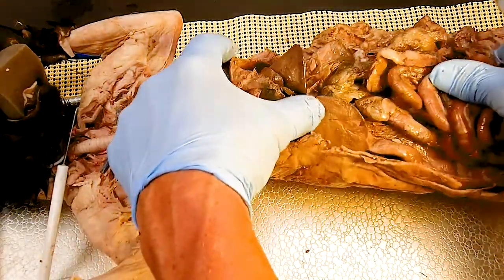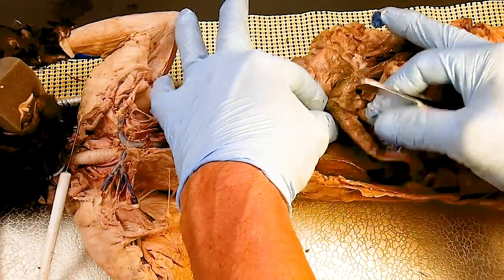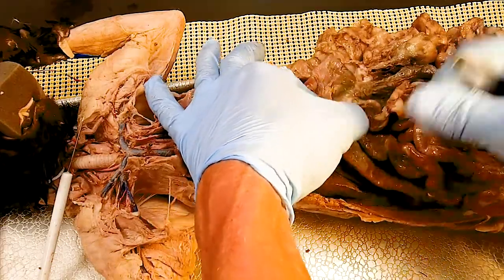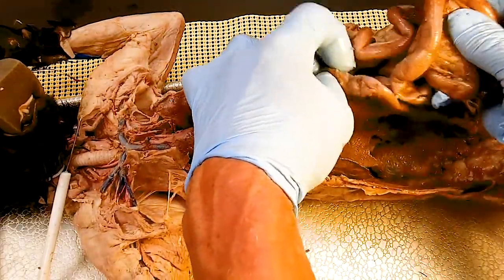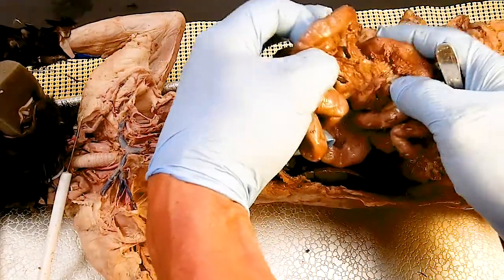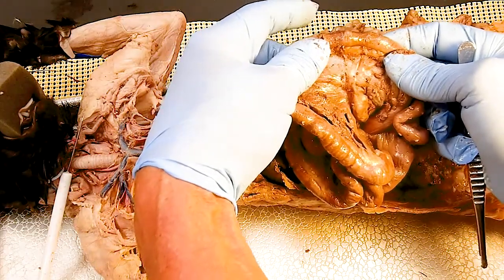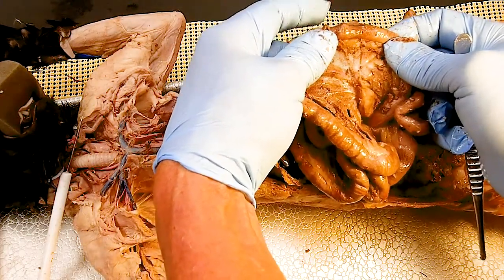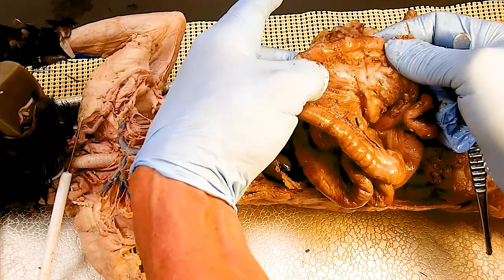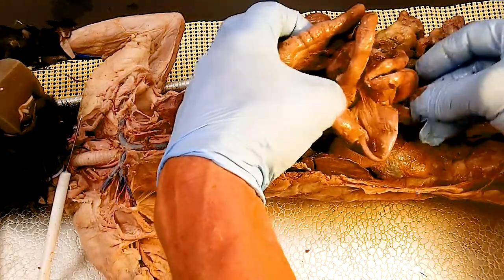Then, looking at the intestine, so here's the pyloric sphincter. This is all small intestine, small intestine, small. All of this is small intestine. These, of course, are the mesenteries, kind of a curtain-like membrane holding these things to the abdominal wall. You see branches of the superior mesenteric arteries and veins running through them. So those are mesenteries. Now this is all small intestine.